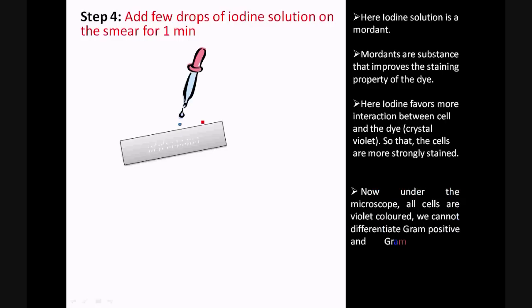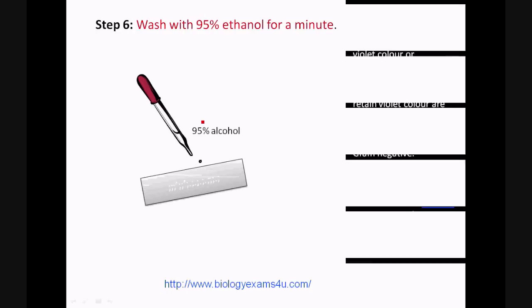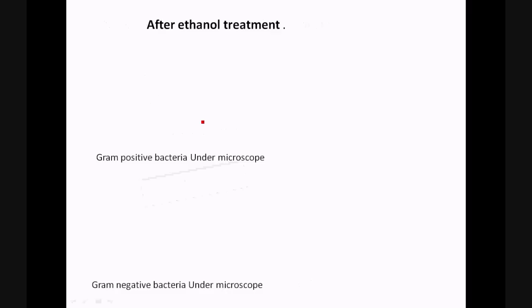Now under the microscope, we can see all the cells in violet color. This is the most crucial step in Gram staining: wash with 95% ethanol for a minute. On washing with ethanol, the bacteria that retains the violet color of the crystal violet is Gram positive. The bacteria that loses the violet color is Gram negative. The difference in retention of the stain is due to the difference in the cell wall composition of Gram positive and Gram negative bacteria.